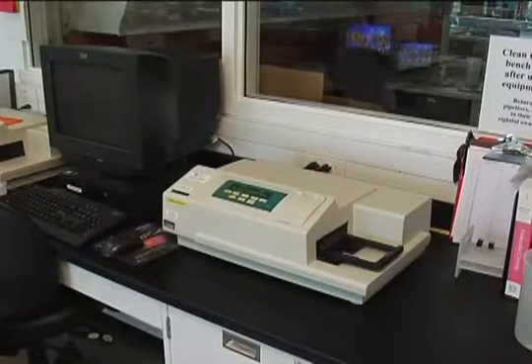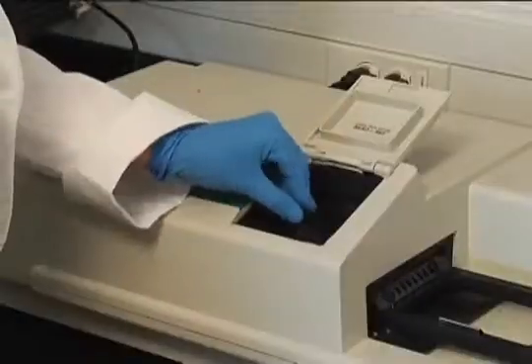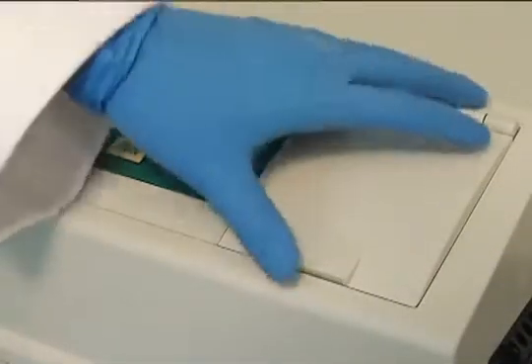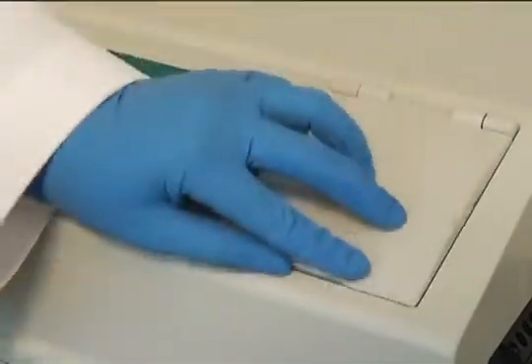If measuring using a cuvette, transfer 1 milliliter of the solution to a suitable cuvette. If a large number of samples are to be run, a 96-well plate and fluorescent plate reader may be used to acquire fluorometric data.